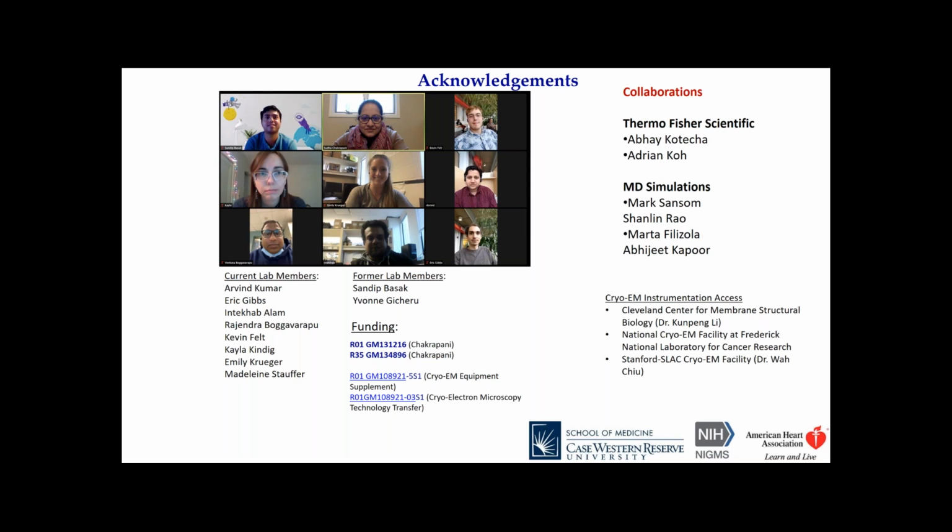Thank you, Sudha. It was a beautiful talk with a lot of implications to drug discovery. We have a few questions rolling in. The first question is, did you encounter any preferred orientation issues in your workflow? Because it's pretty common with membrane proteins. And if you did, how did you address them?